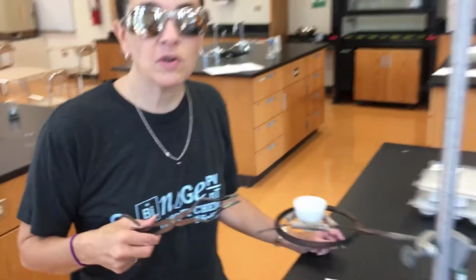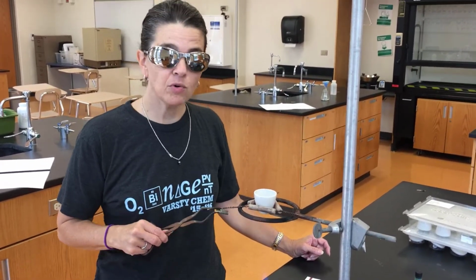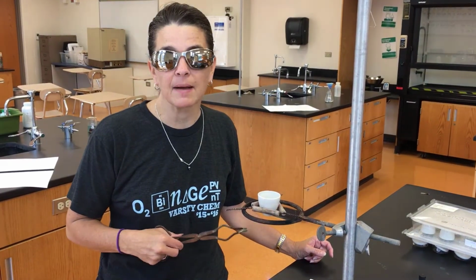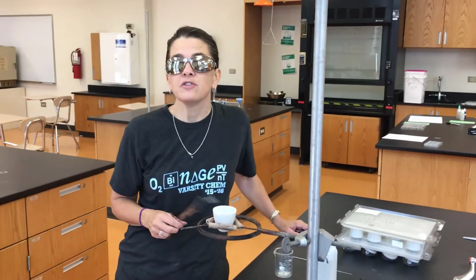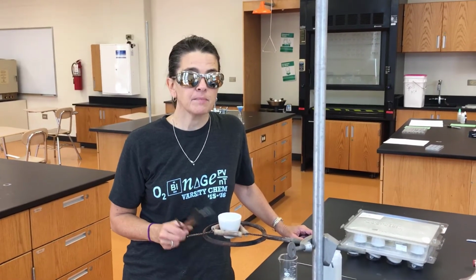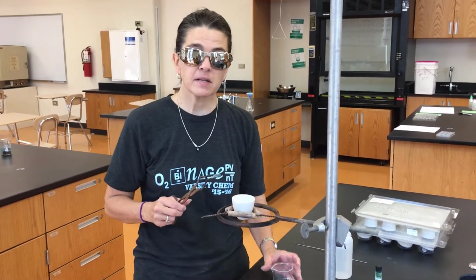So when this has gone completely brown and that greenish color is gone, then we will let it cool for a minute and we'll take it on to the next step. You'll get a mass at that point. Okay, so now we have a completely dehydrated sample. In your data, you will have the mass of that dehydrated sample with the crucible. And what we're going to do now is work on separating the copper and the chlorine.